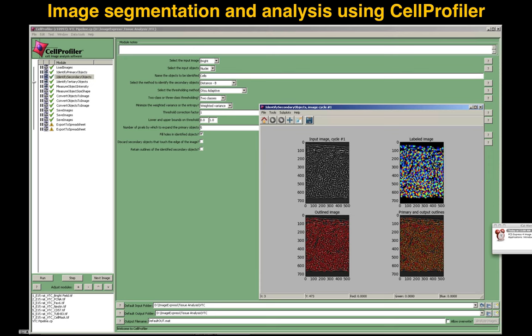In this case, you can actually see that the individual cells can be demarcated by the phase contrast image as individual circles, and that can be used as a nice way to identify individual cells. So you don't even need cell mask in that case. Sometimes cell masks are not very reliable when you have very densely packed cells that overlap each other, but the bright field seems to be working well in this case.